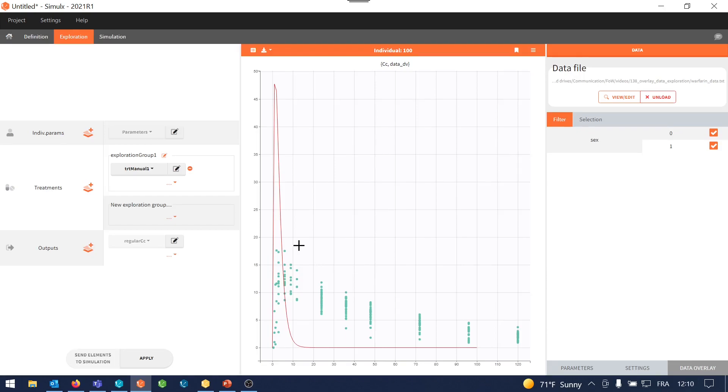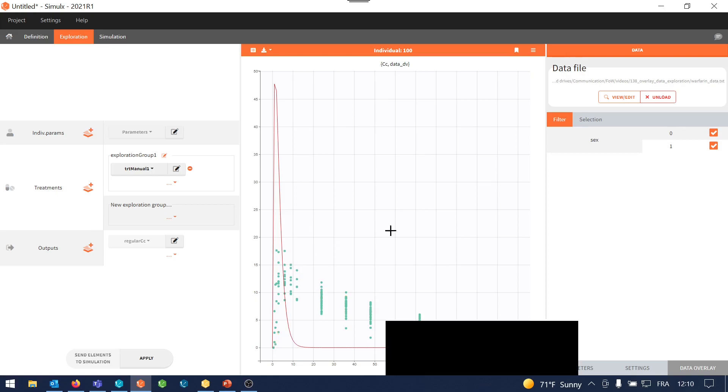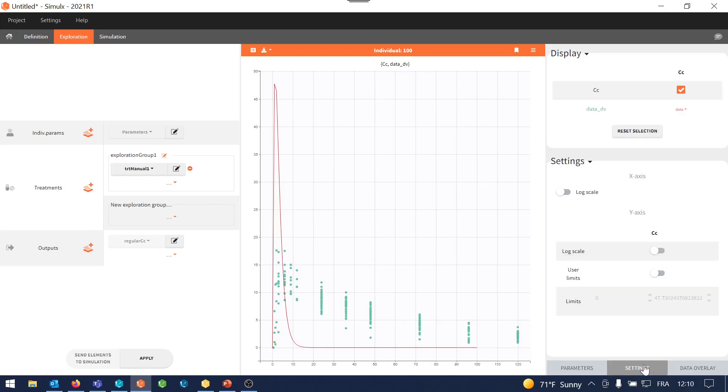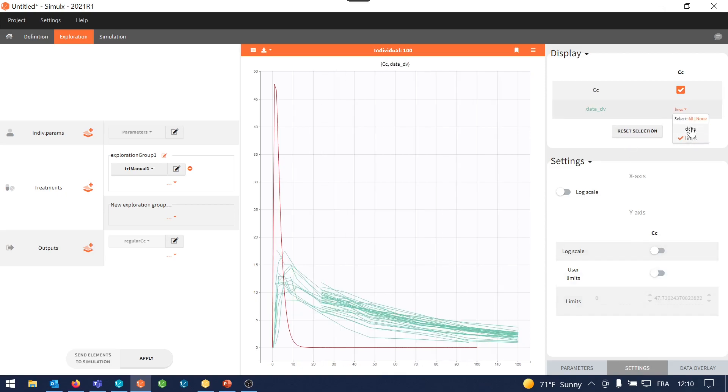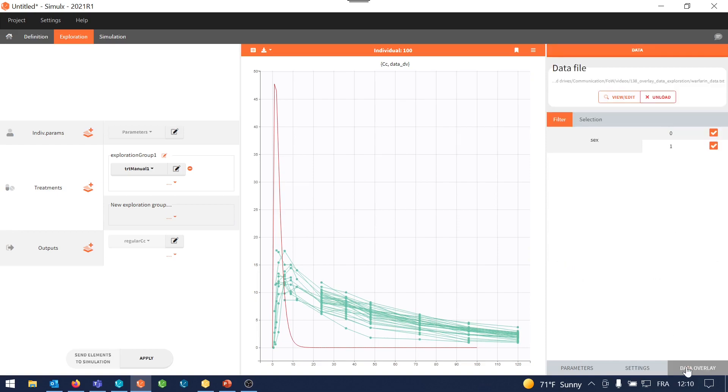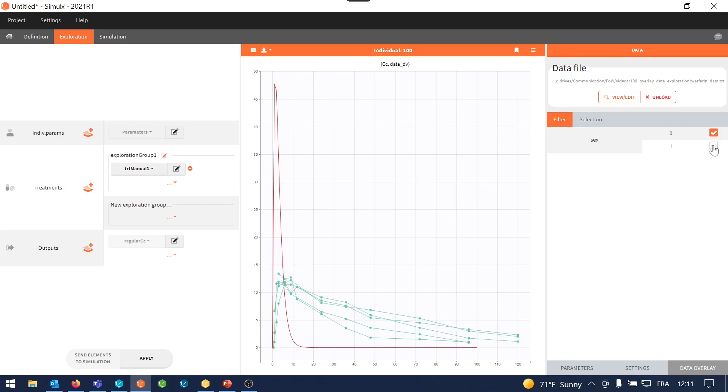So the data display is interactive. So if I hover on a dot, I can see all the points related to the same individual. I can display the data as dots, or as lines, or both. And the data can be filtered by all the categorical covariates included in the dataset. So for example, here I can display all females.